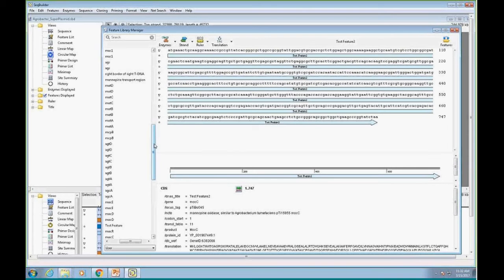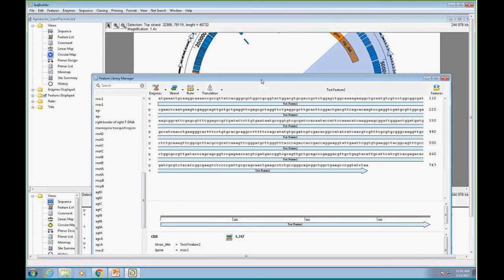Yes. So there is some continued development. We released this new annotation capability in 14.1. You will see some new improvements in Seq Builder in the future. Some of the look and feel of the different maps and some of the different views in Seq Builder will be updated. So certainly if you're a Seq Builder user, you'll want to check out both 14.1 and any improvements. There should be plenty in the next release.